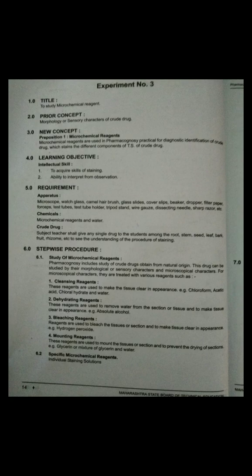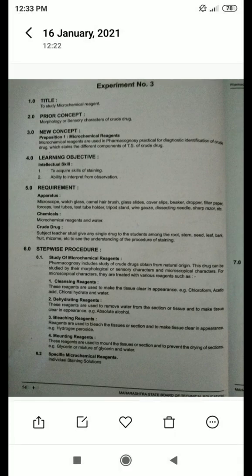Then next are the mounting reagents. These reagents are used to mount the tissue or section and to prevent the drying of sections. Examples of mounting reagents are glycerin or a mixture of glycerin and water.